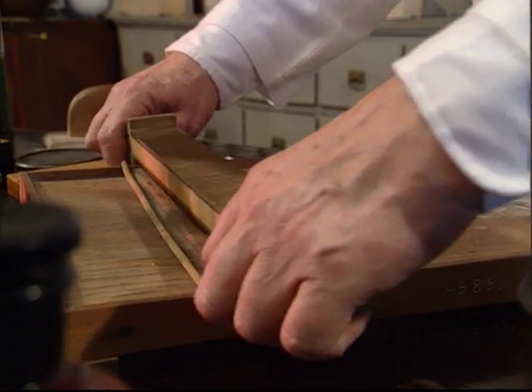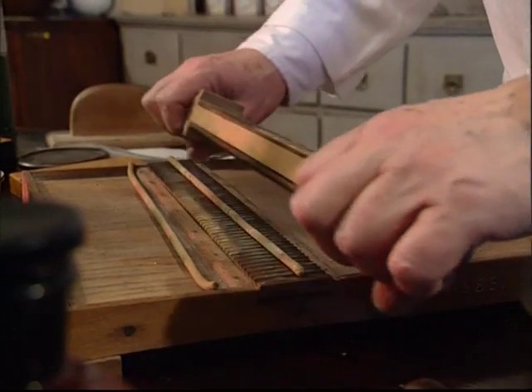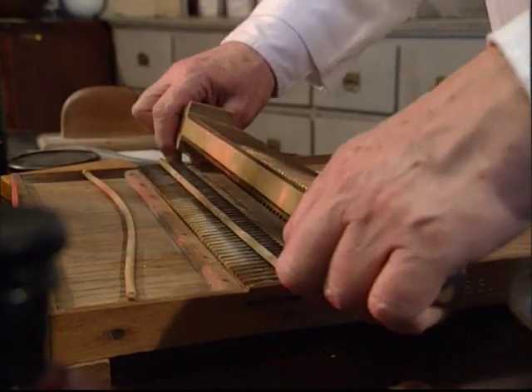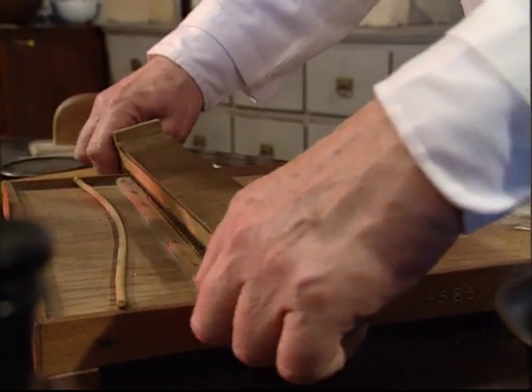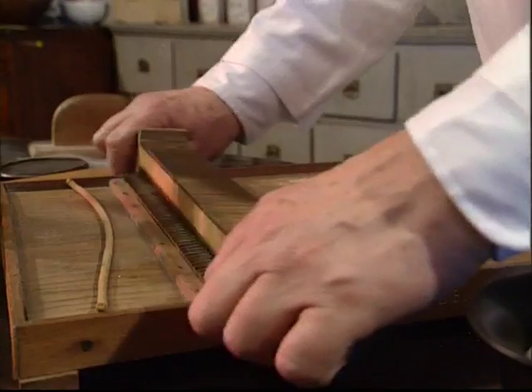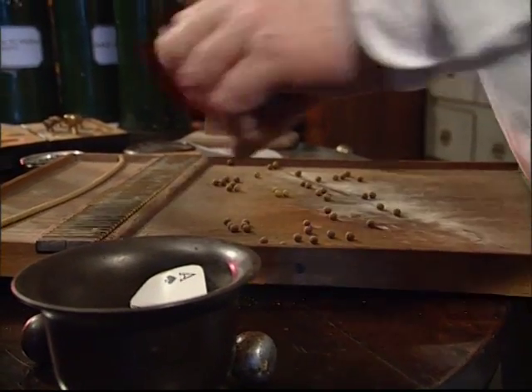And now we can cut them up. Working with a pill former demands great sensitivity. If you apply too much pressure or work too quickly, the pills won't be round. There. That's pretty.